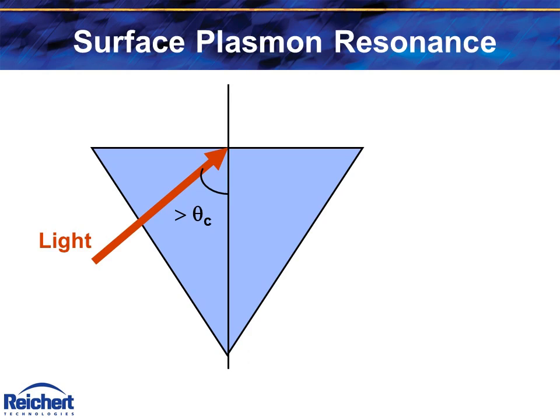Now I will proceed to talking about the principle of SPR. To induce the surface plasmon resonance phenomenon, a wedge of polarized light, spanning a range of incident angles, is passed through a high index of refraction prism under total internal reflection conditions. In this case, all the illumination light is totally reflected off the prism, and the reflected light is very intense across the entire reflected beam path.